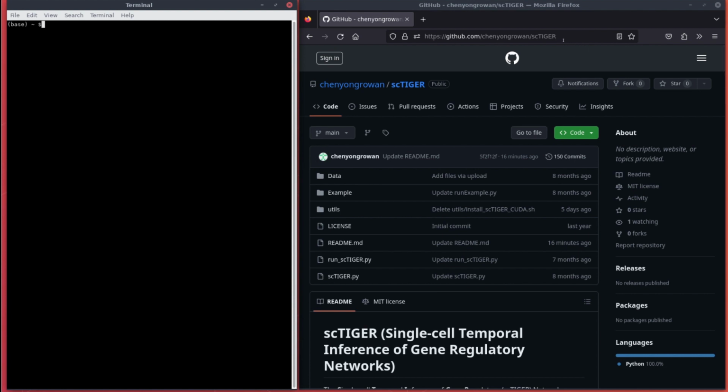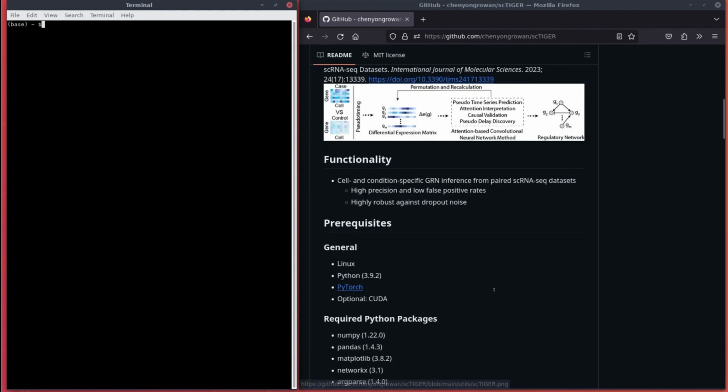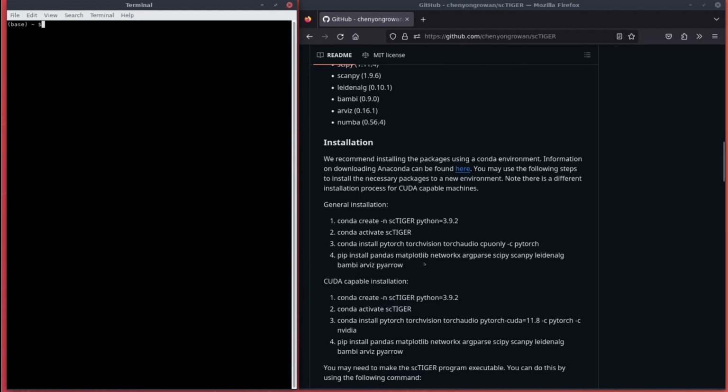For this video, you'll also need to have Anaconda installed. If you need, I linked the Anaconda installation instructions in our GitHub page. You'll want to scroll down to installation and then click on this link here. This will help you to install Anaconda on your device.